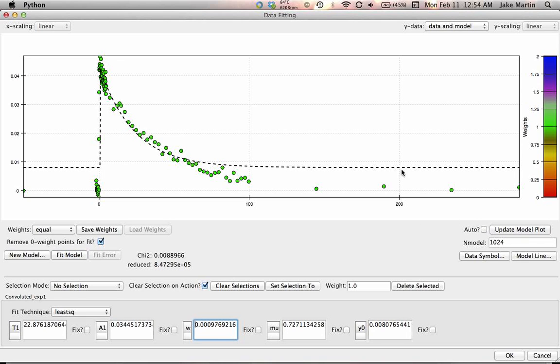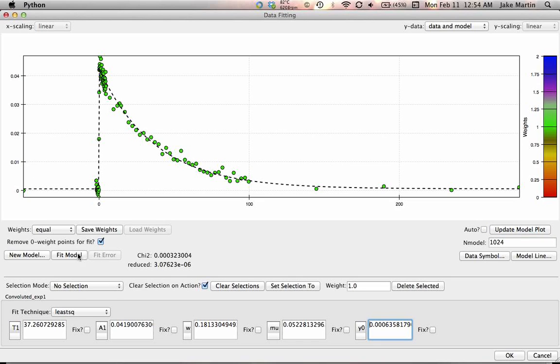So now we've got, maybe if we do that 0, let's try something. Let's try to get our initial guess a bit better. That's a much better fit.